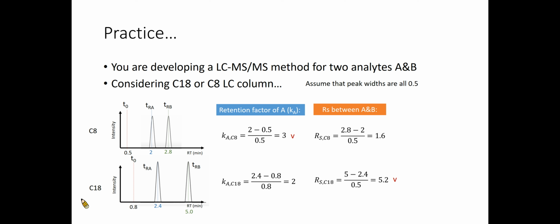For the C18 column, the solvent peak arrives at 0.8 minutes, where TRA and TRB are 2.4 and 5 minutes respectively. Again, we can calculate the analyte A's retention factor and the resolution value of 5.2.